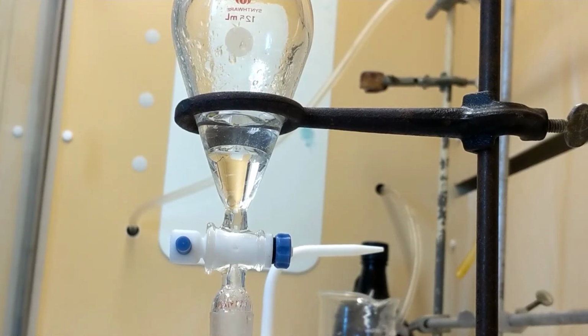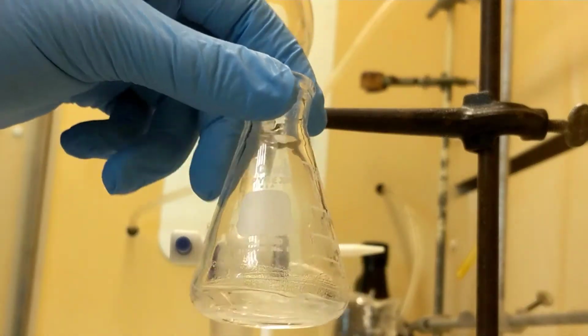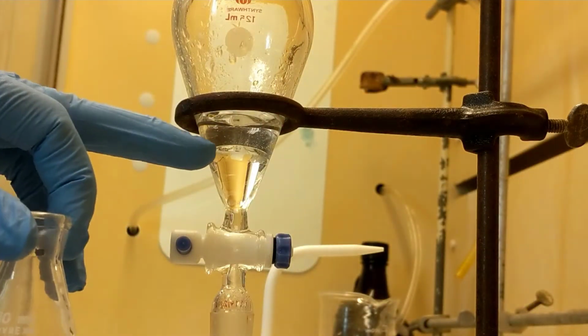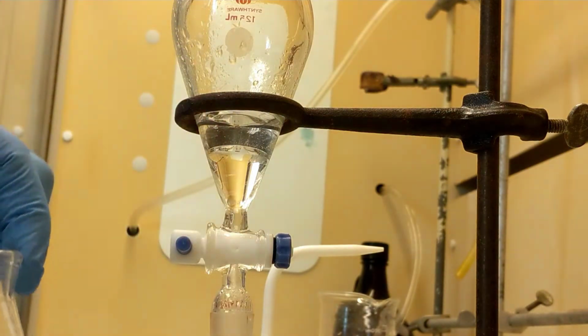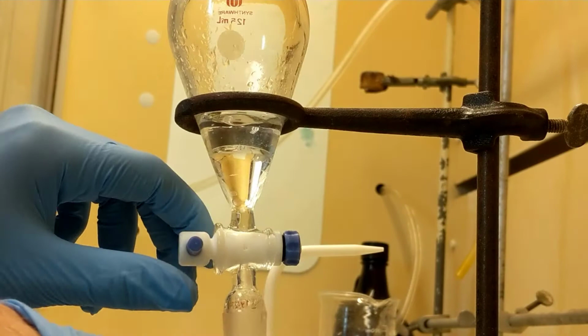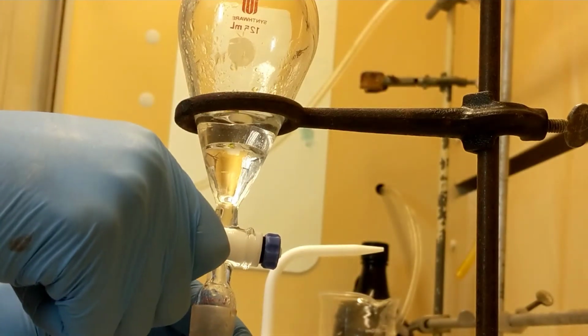Alright guys, we're back for the second extraction. I'm going to do the same thing. I already added 5 milliliters. I've shaken it up a little bit, and now I'm just going to move the methylene chloride, this bottom section, down into this flask with the rest of it. Second extraction. Let's try to be a little better than the last time.